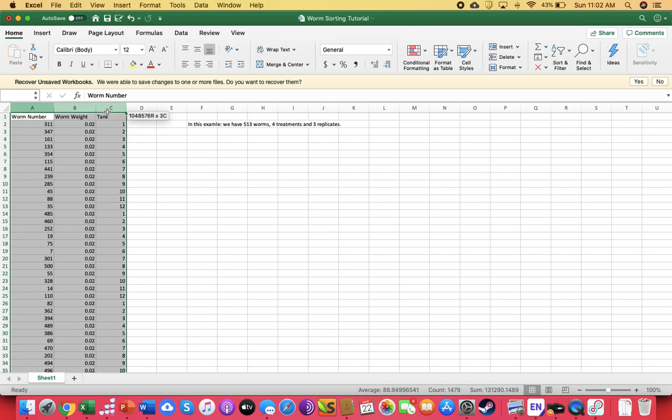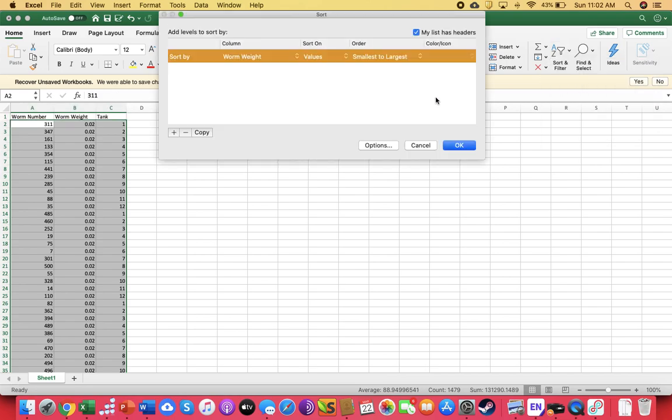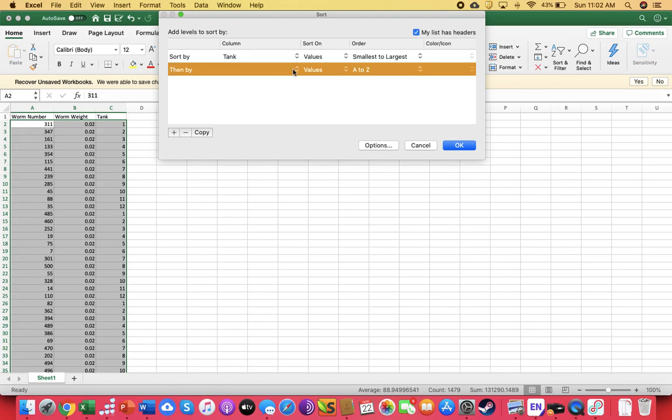All right, well, that's a pain to deal with, so what we're going to do next is sort. What do you guys think we're going to sort by? What are we going to sort by? What? Nobody's answering me? Okay, it's going to be tank. I'm sorry, we're going to sort by tank, and then we're going to sort by worm number so that we can make it a little easier for us.